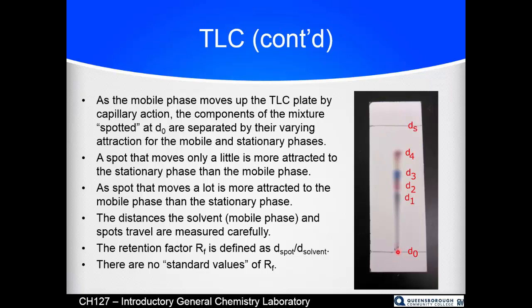You spot your sample near the bottom, not all the way at the bottom, for reasons that we'll discuss on the next slide. But it would just dissolve into the mobile phase rather than get carried up the plate. And the plate will be resting in a little vat of mobile phase, so below this line that you've drawn on there, that's as far up as the mobile phase could come in the vat.